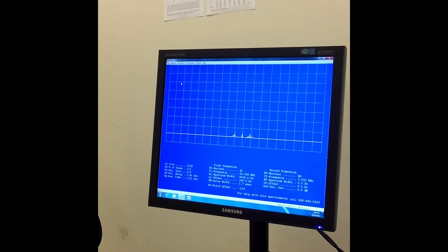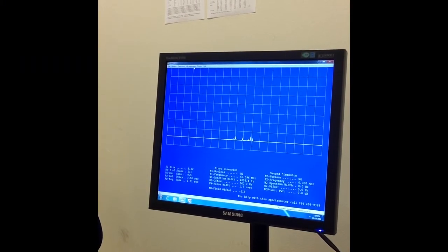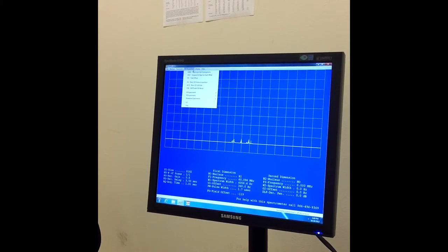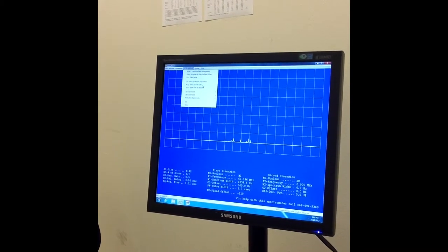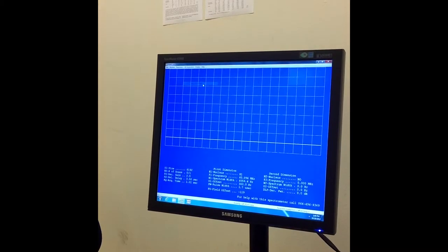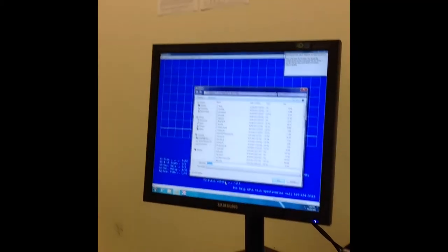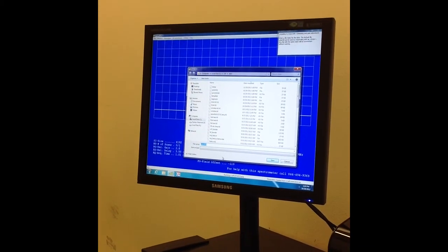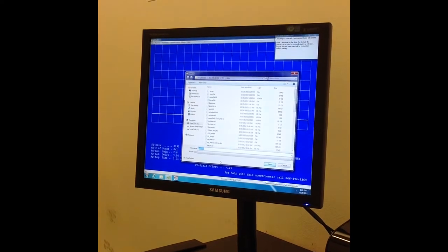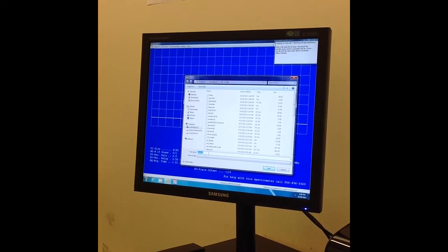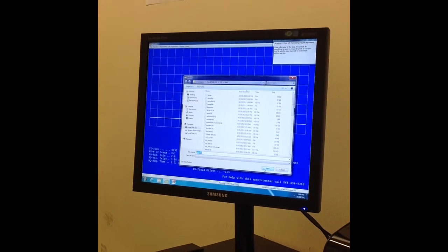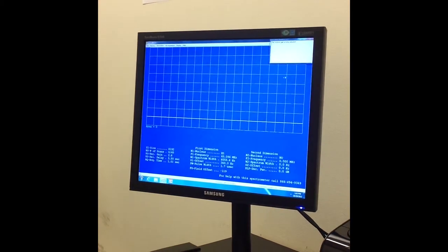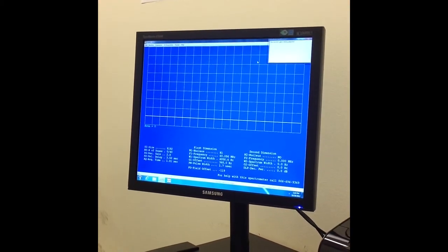Now you're going to acquire under the H1 Acquisition tab, so I'll just click on that. I go down to ACQ, left click, and now it's going to ask you for a file name. You can give it a name, and I'm just going to stick with this default that I have here. I'm going to save, and then now the receiver gain is being adjusted.